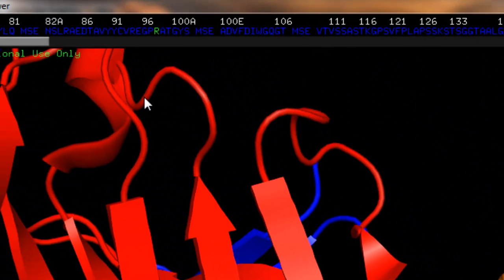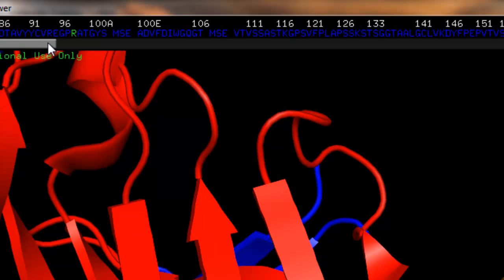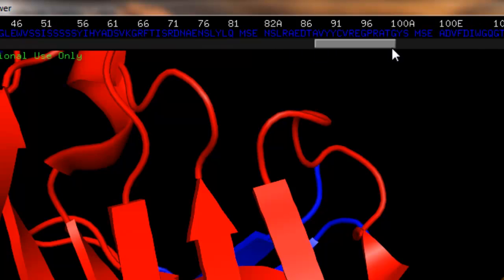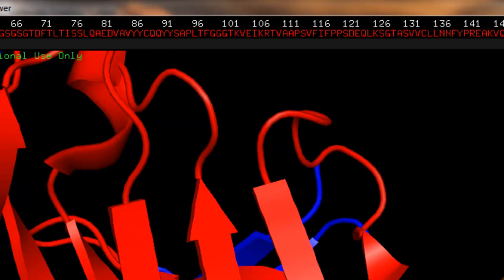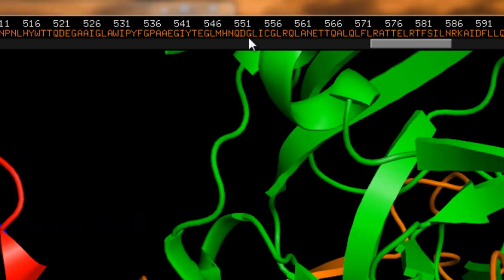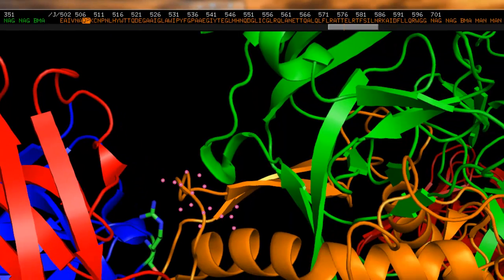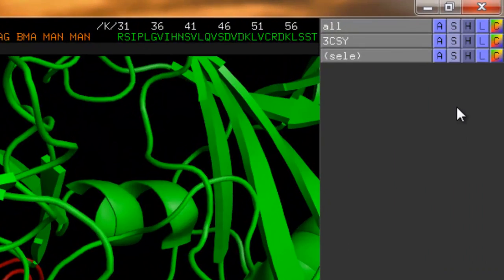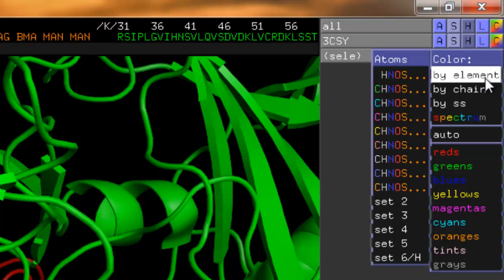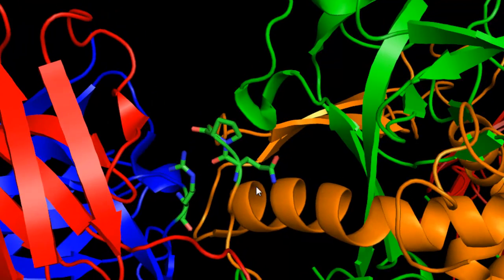What else do we need? We need 508 and 509. For the GP2 subunit, we're going to scroll all the way down. I know for sure it is this one, chain J. We're going to select 506, 507, 508, okay, and then 509. Great. We're going to show sticks, and color by element the same way we did last time. Now we see these 3 residues.